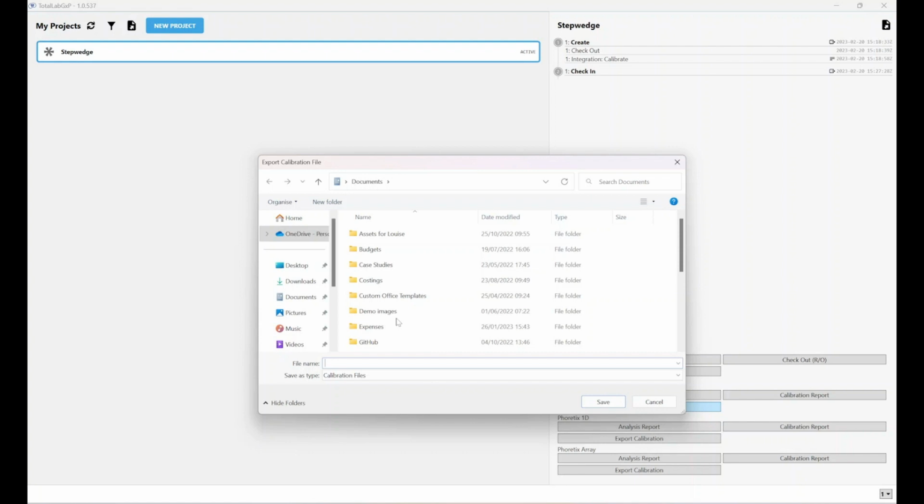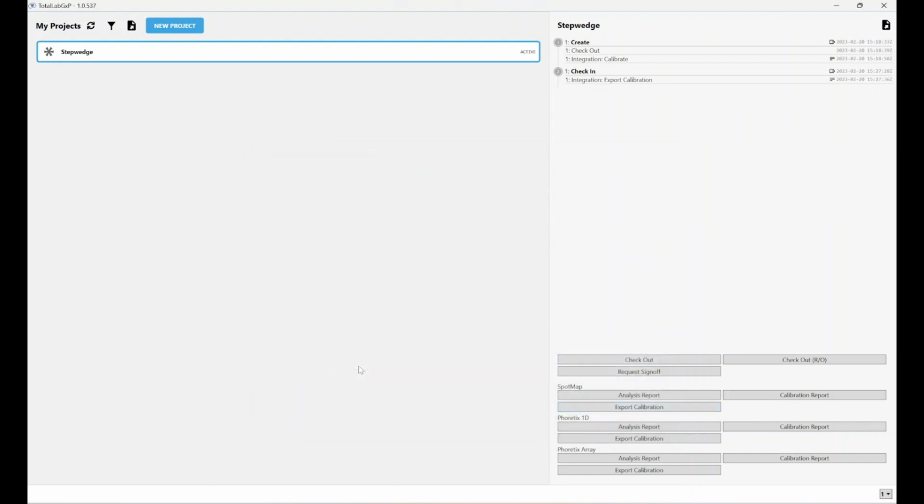You can also, of course, apply the calibration yourself multiple times. So if you have multiple different images that you want to calibrate, you can use the same calibration map for each one, or you can use different calibration maps for each different image. So if you've got 3 different scanners and you're analyzing 3 different images, but it's all within the same piece of software, you don't need to go out and recalibrate them all. If you've already calibrated those scanners, you would just apply the calibration maps that you've already defined from those 3 scanners in that example. So if I just call this demo calib, save.